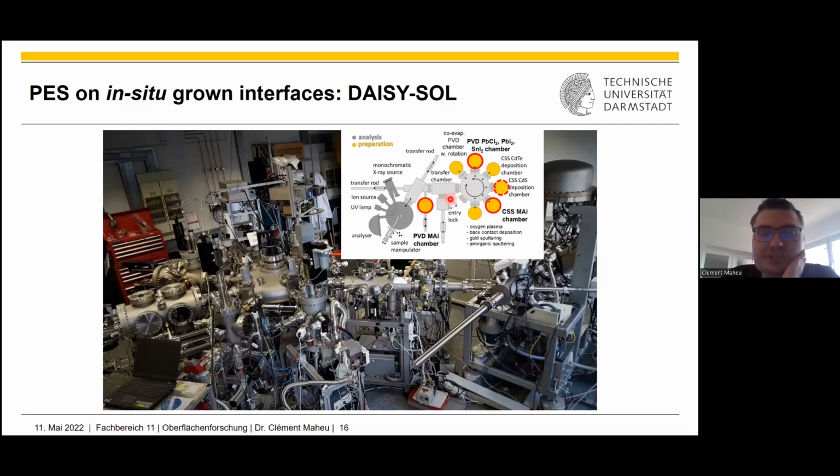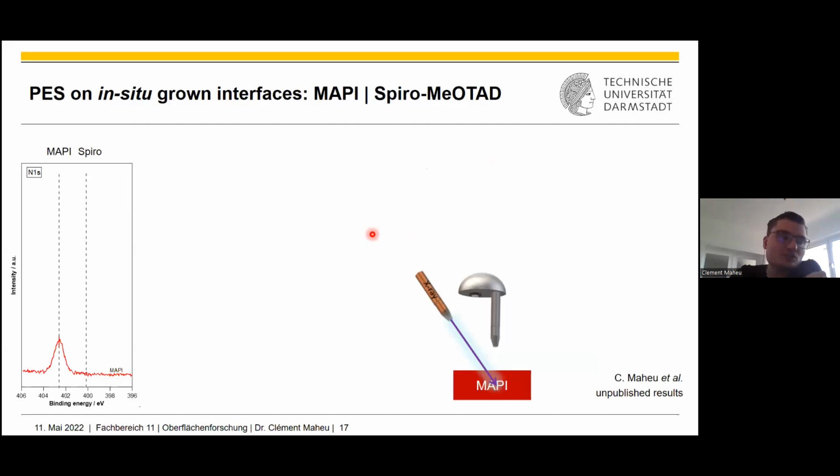And then without having atmosphere exposure, you can measure directly your sample inside the machine. And this leads to what we call interface experiment. And this has been reported in the literature for decades, and this is really what was done in my group for decades. So let me explain it a bit. You start with one material.